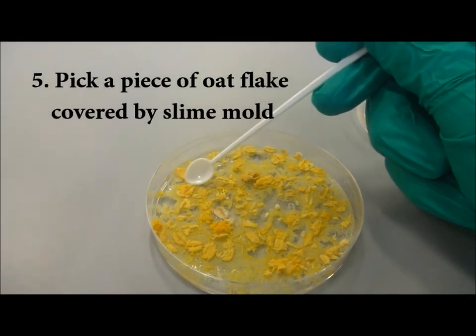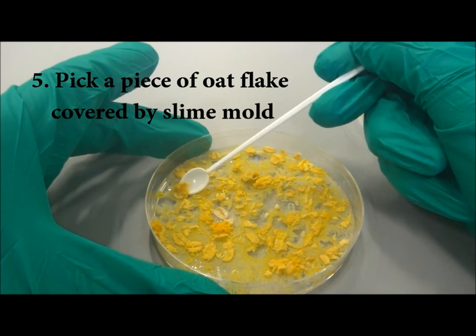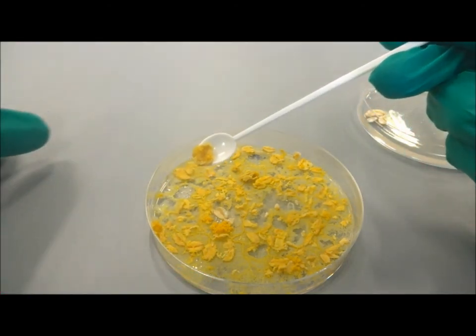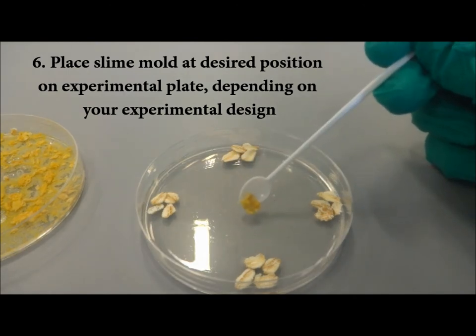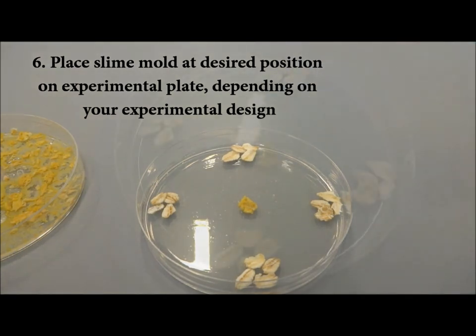Use a clean spatula to pick up a piece of oat flake that is covered by slime mould. Do note that the slime mould fragment may feel soft and fragile. Place the slime mould fragment onto the experimental plate. The slime mould fragment may sometimes be sticky and can be hard to remove from the spatula.